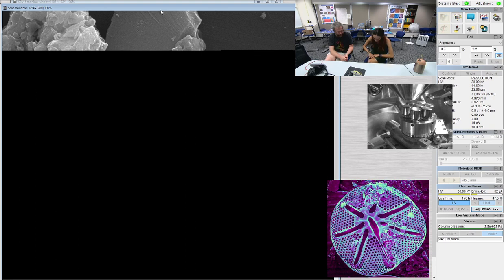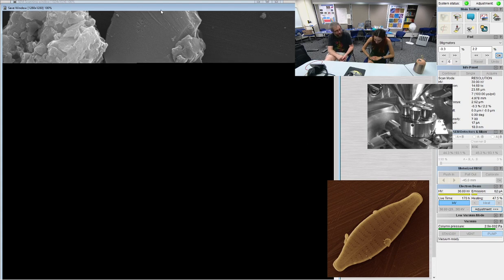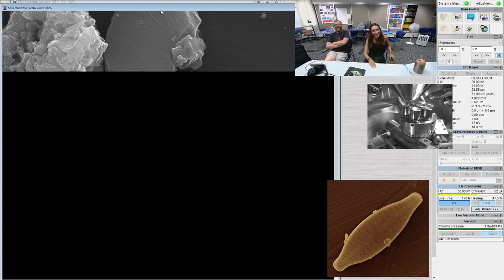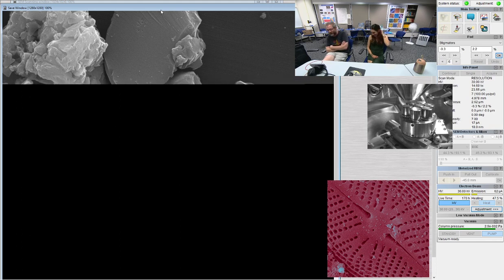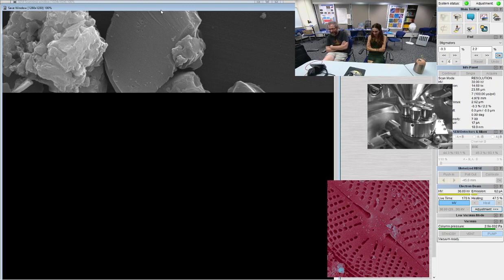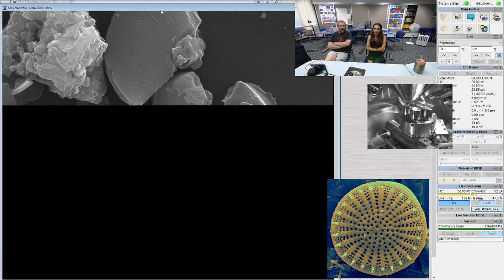Today I tried to get a little sun, but there was too much shadow from the thing, so. I mean, the girls seem to like it. Because it's not on them. I suppose. I don't think the Nitzschia is blurry, though. We haven't gotten to it yet. Yeah.